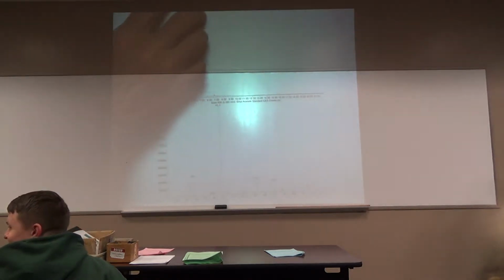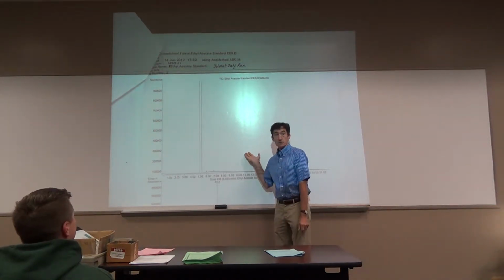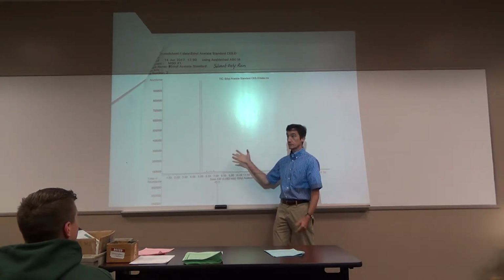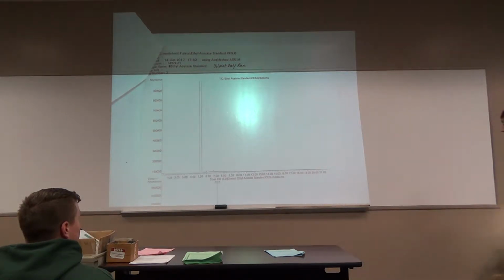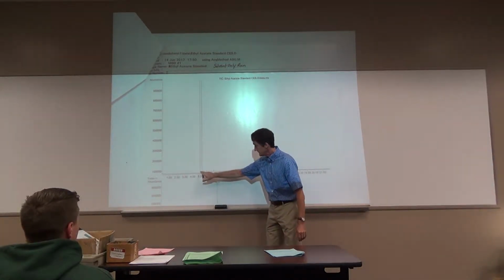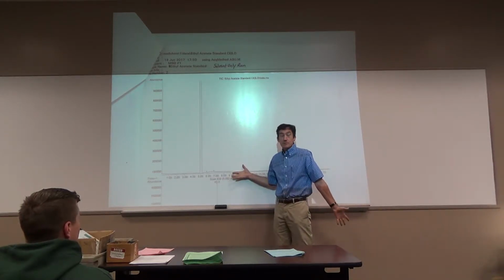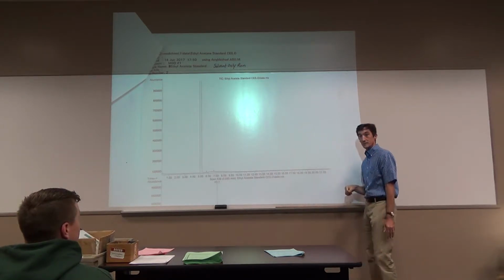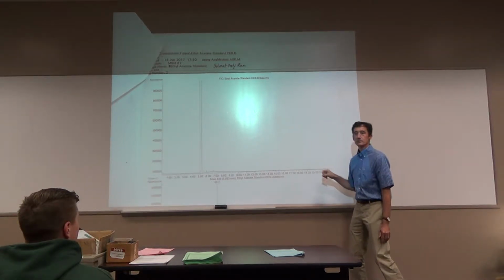Here's a GC of just solvent. This is there because you added the solvent. So you subtract these signals from your other one, and then you say, what was just there from my compound? Well, you see something's missing here. That huge peak must have been from your compound because it didn't come from solvent. So that's why I gave you a mass spec of that one. Now, there's also nothing out here, so what was out here must also not have been from solvent.